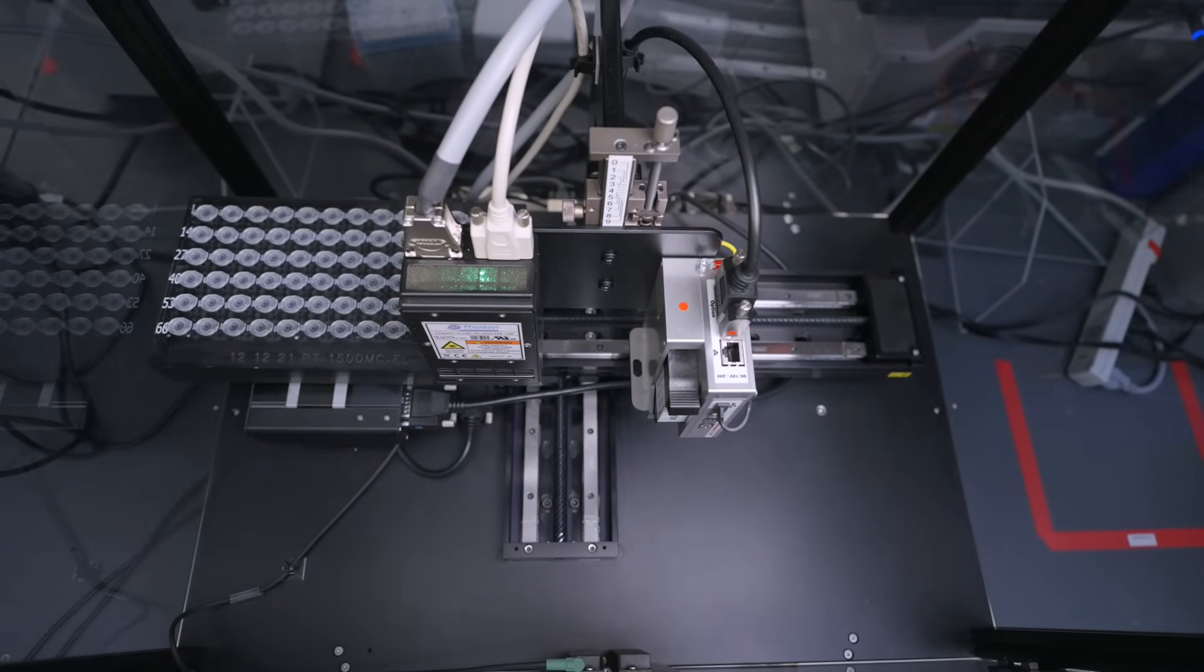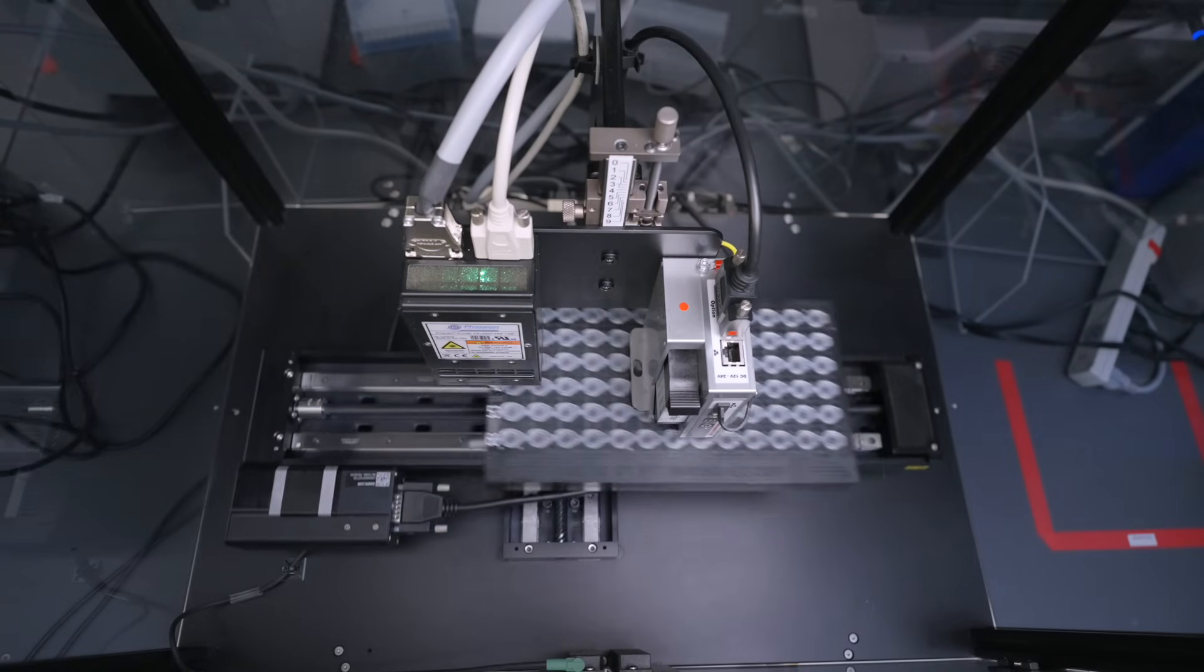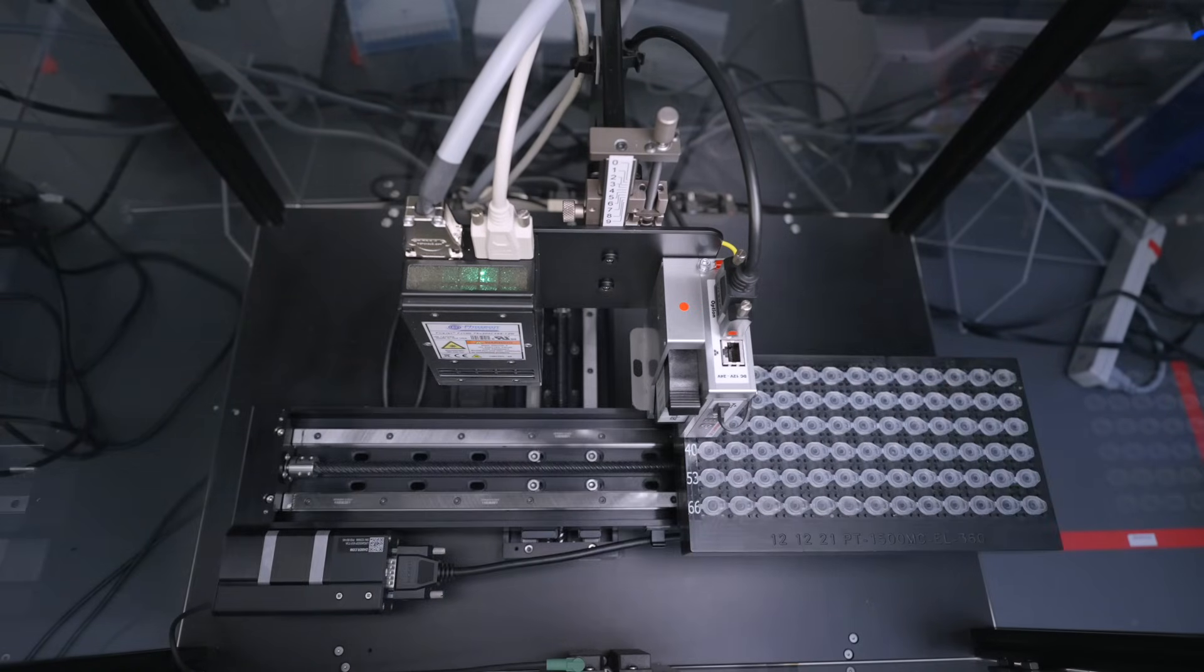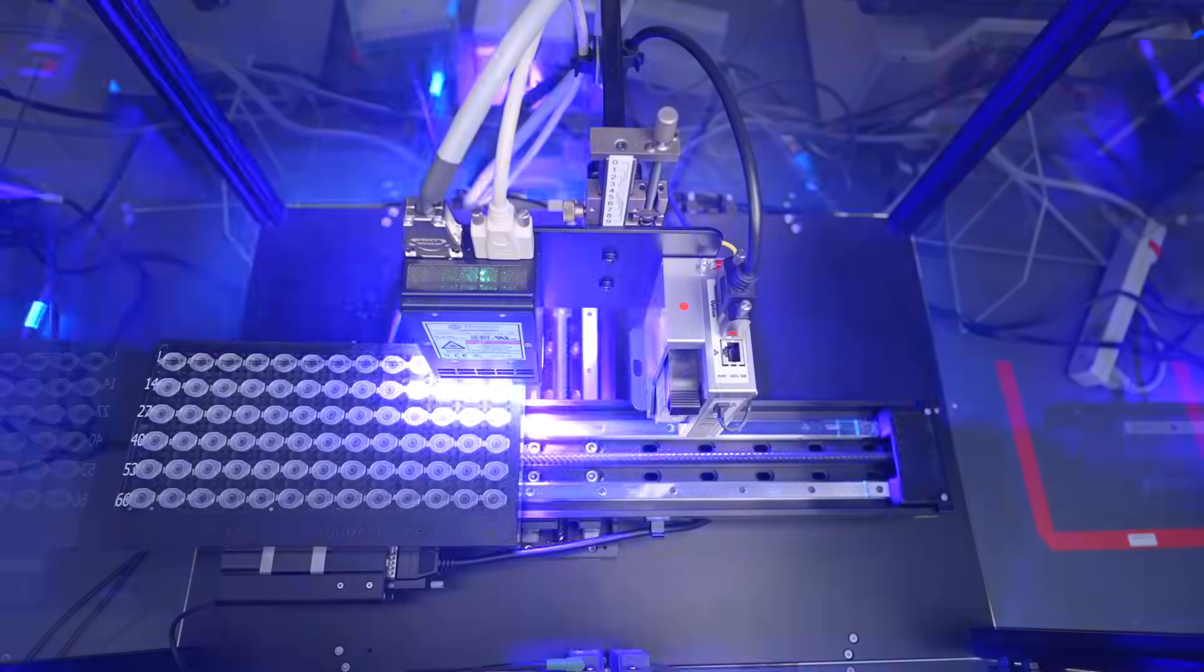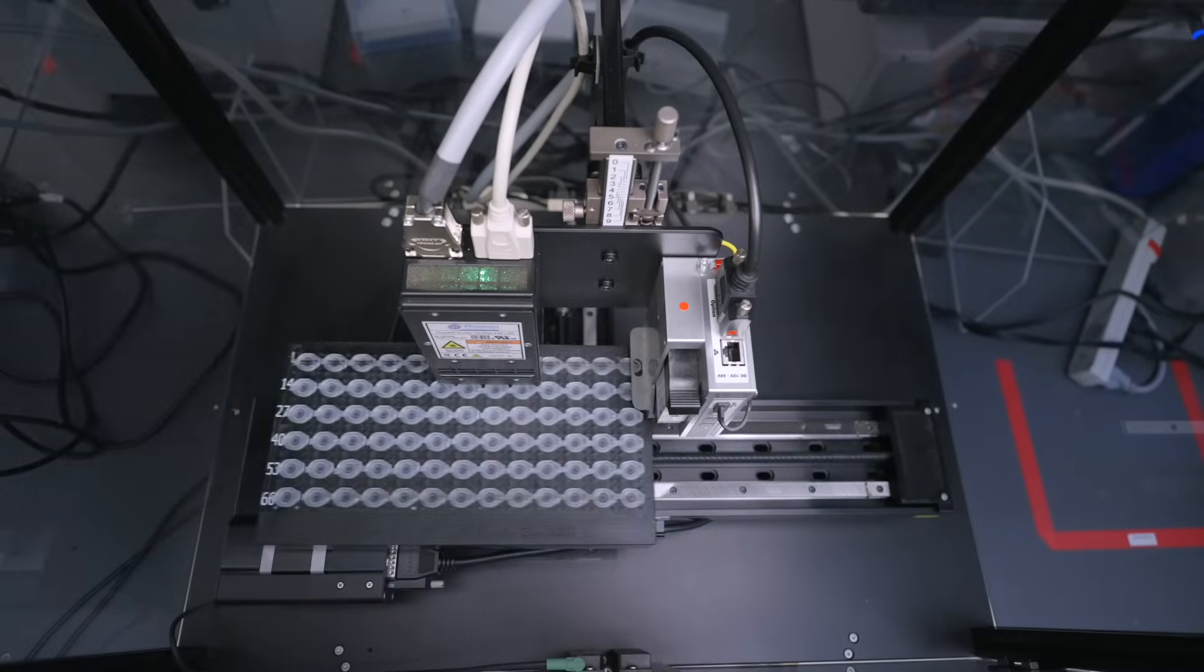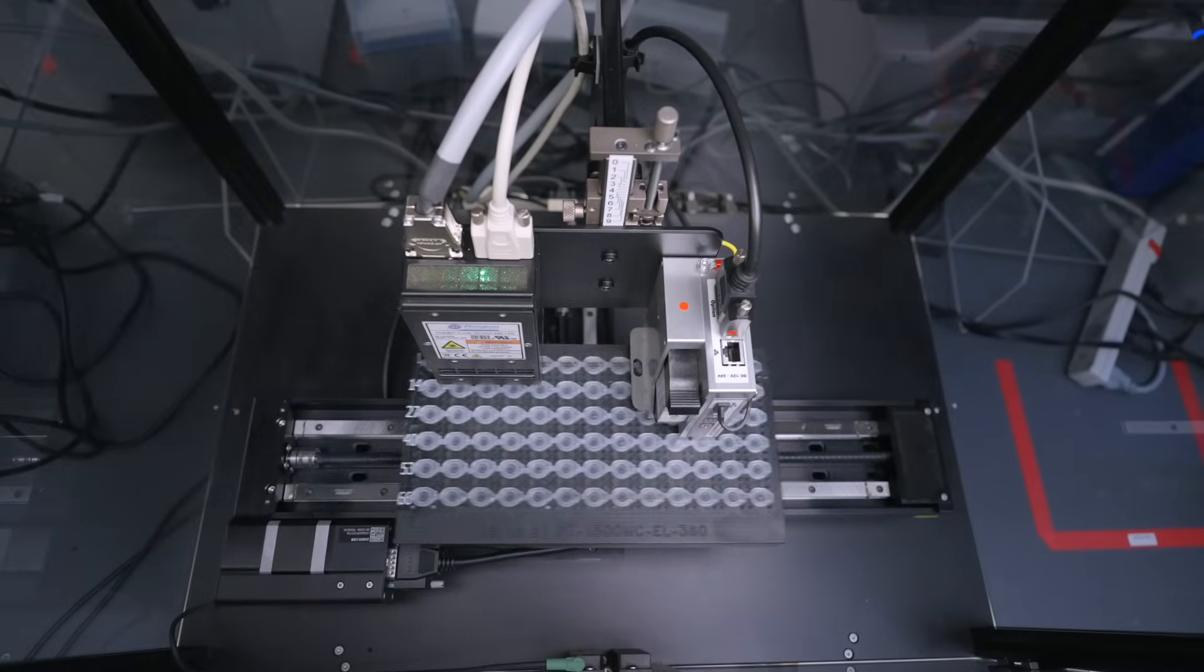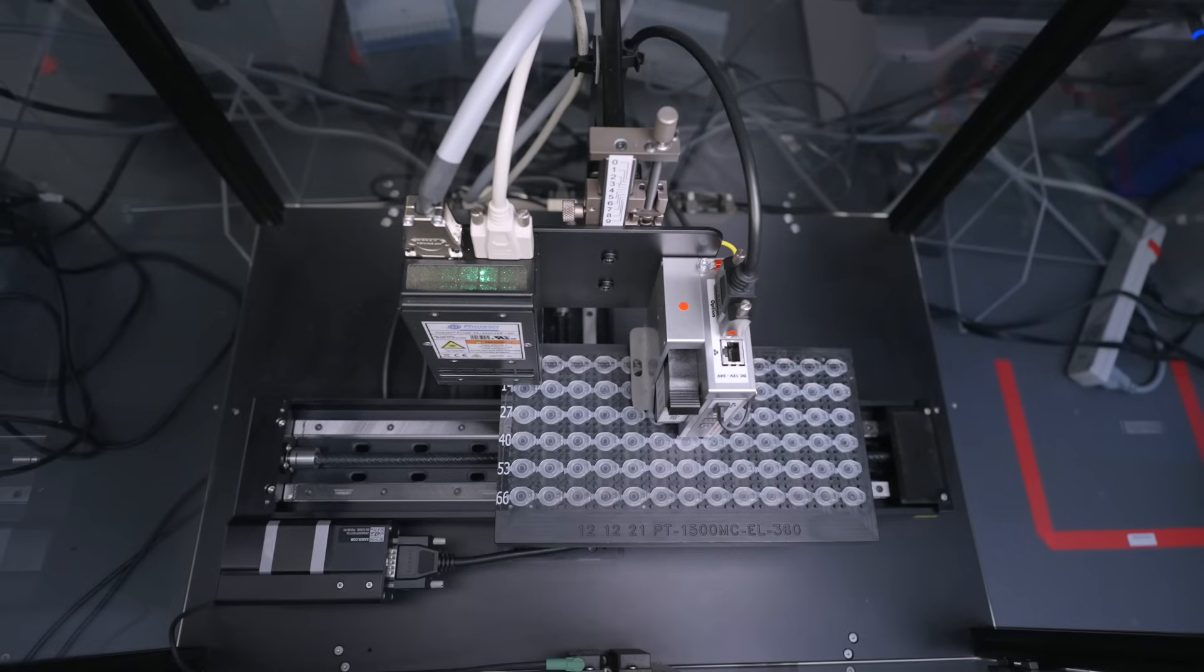The stage is moving to the back left corner to home. It's preparing to print the entire first row of tubes. It just spit all the ink out, and now it's flashing the UV light to cure that ink on every tube in that first row. Then it's going to move down to the next row and start printing the entire second row.